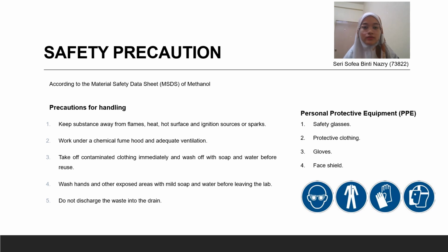Take off contaminated clothing immediately and wash with soap and water before reuse. Wash hands and other exposed areas with mild soap and water before leaving the lab, and do not discharge the methanol waste into the drain. The personal protective equipment suggested are safety glasses, protective clothing, gloves, and also a face shield.